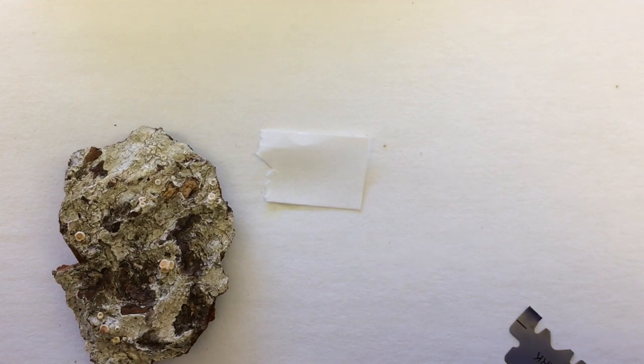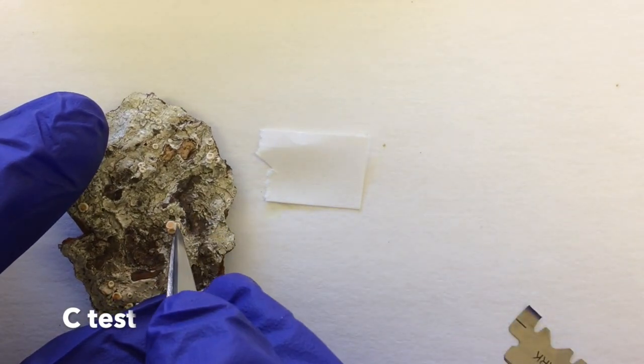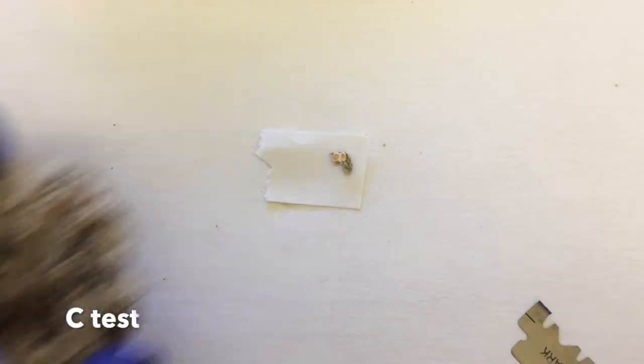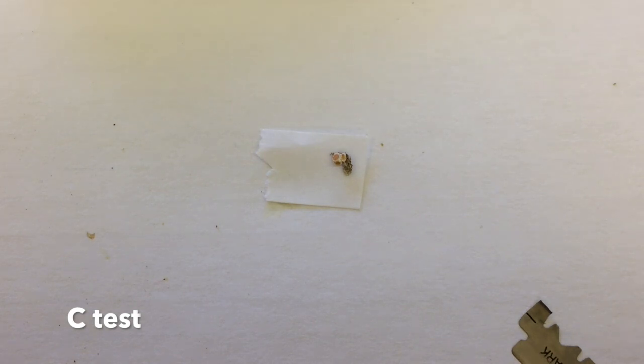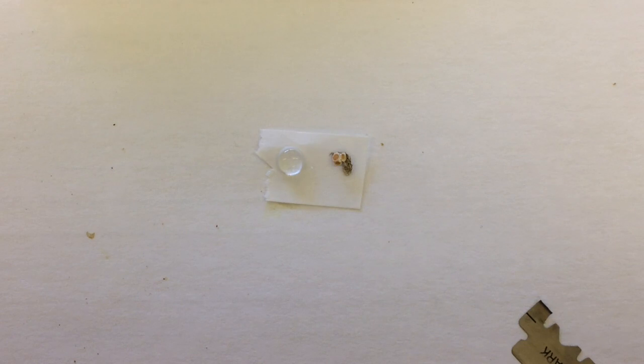The C-test is performed in the exact same way as the K-test. You can either use a glass capillary for this reaction, or you can use this method using a piece of scrap paper and a drop of the reagent, depending on whatever works best for you.